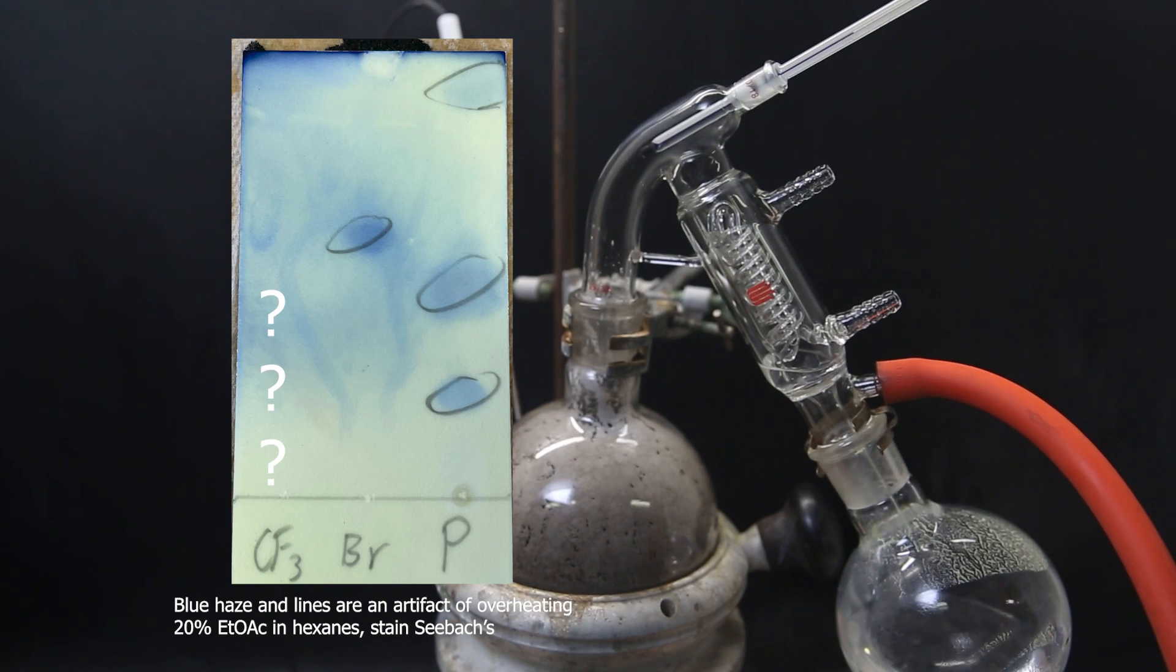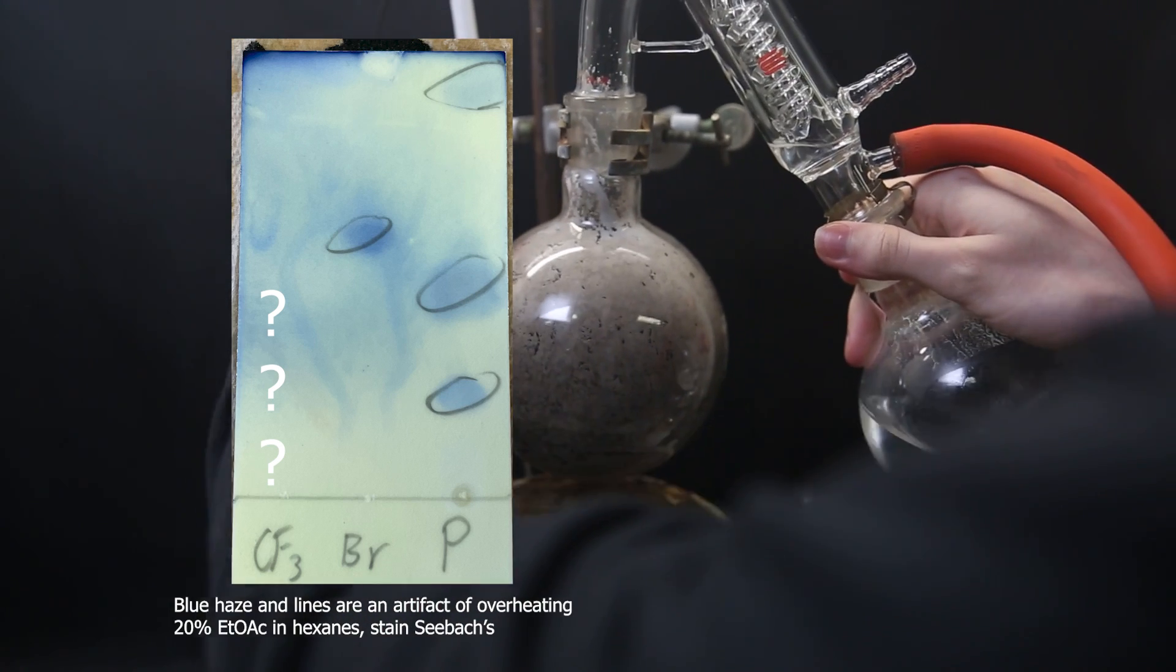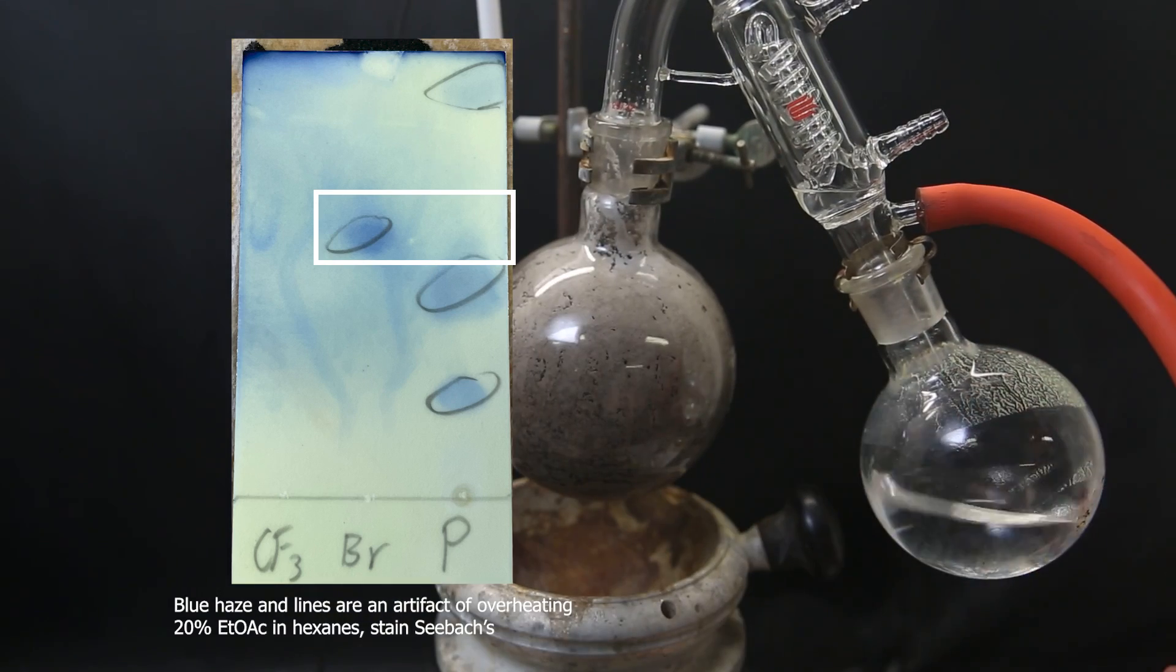The boronic acid starting material doesn't seem to stain, but it's not really a problem since it's likely to have all reacted away anyway. We can see that with the 4-bromo benzaldehyde, as it doesn't show up in the product mixture.